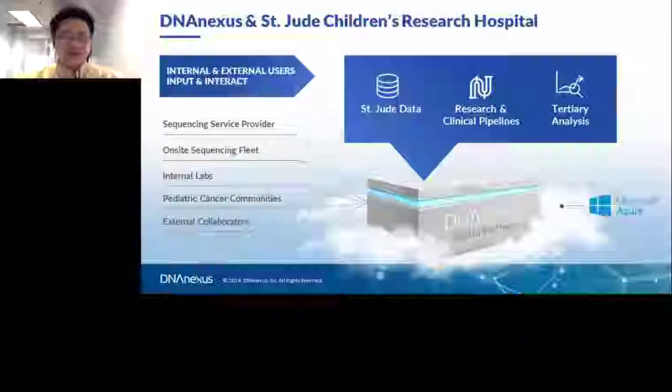Too many of the existing data access platforms simply provide data and tools to download them. However, this doesn't solve the core problem of having multiple copies of data, and as data volumes grow, this cost increases. St. Jude Cloud Platform is more than just an FTP server, providing the underlying framework to perform novel analysis. The system also allows for easy running of the St. Jude tools on data which the user brings in.